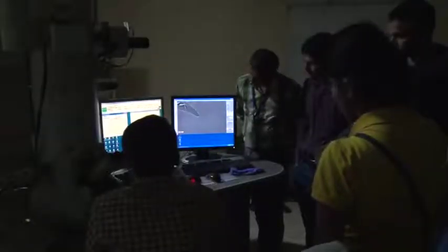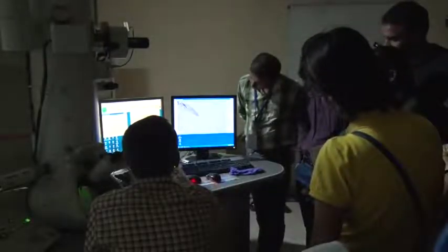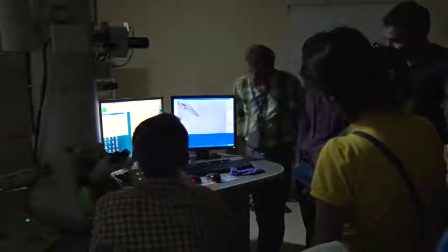I will reverse the direction, that is, I am making my lens stronger and going closer to focus, and this is more or less the focus. If I go further in the other direction, then the dark fringe begins to appear. But this dark fringe, as you can see, is probably not entirely homogeneous. That inhomogeneity in the intensity of the fringe is the indication of astigmatism.